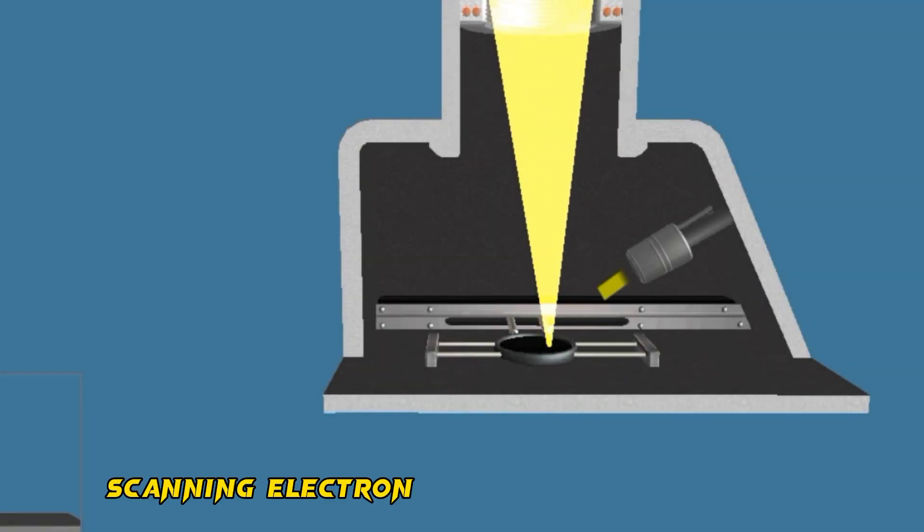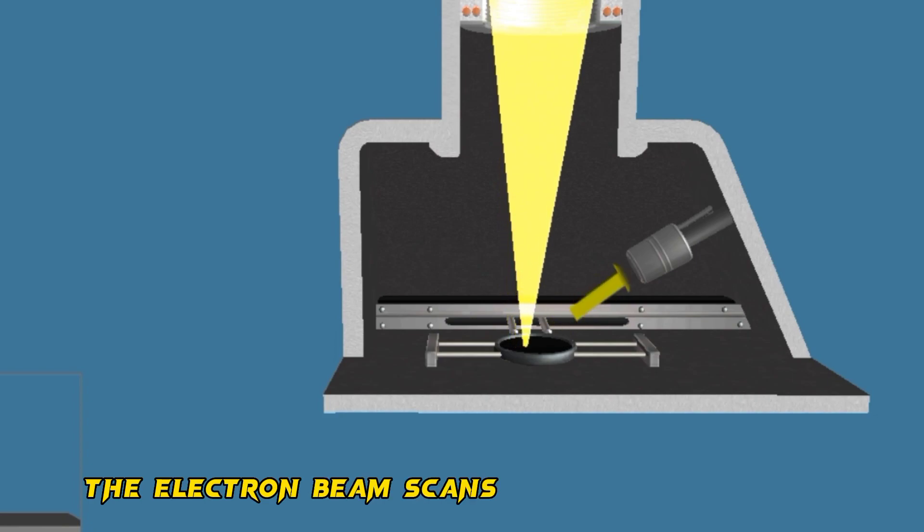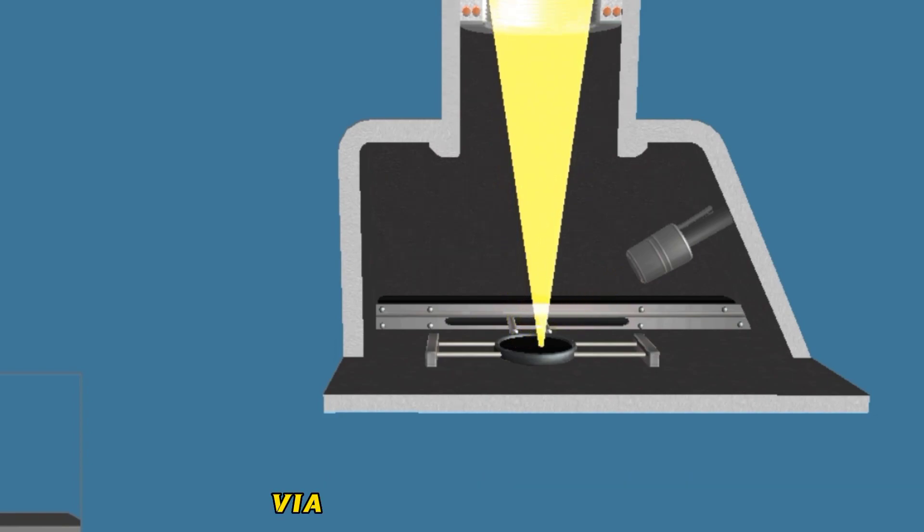Scanning electron microscopes create 3D images of the surface of the samples. The electron beam scans the surface of the sample via the deflection coil.